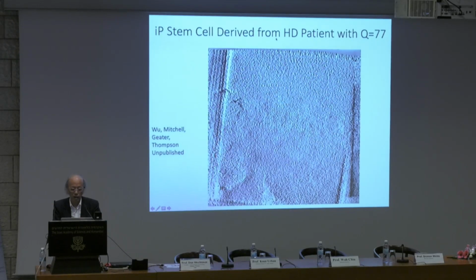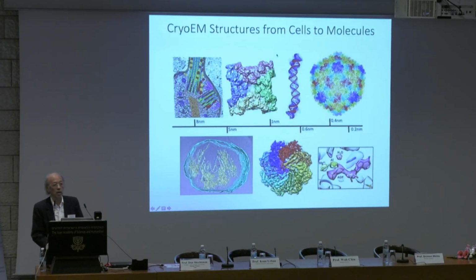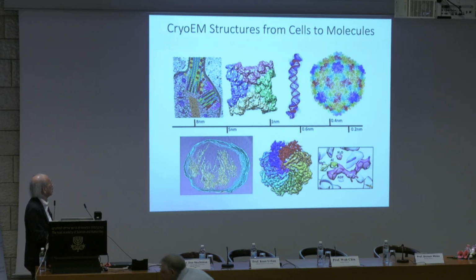solution to it. And finally, I think I have shown you that cryo-electron microscopy can span the range from 80 angstrom to 2 angstroms, from a whole cell to organelle to molecular machine as small as a piece of RNA molecule, and we can begin to see water and metals.